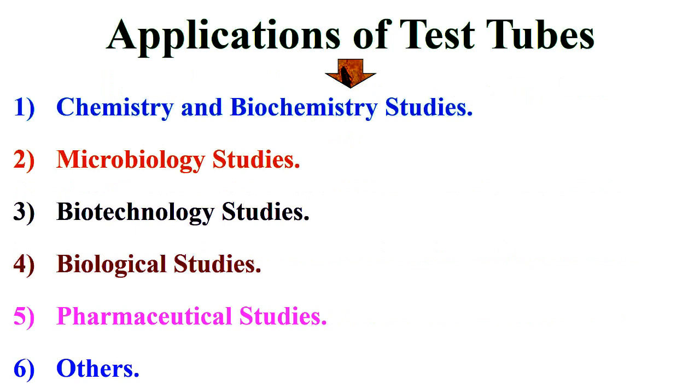Finally, test tubes are used in chemistry and biochemistry studies, microbiology studies, biotechnology studies, biological studies, pharmaceutical studies, and other studies.